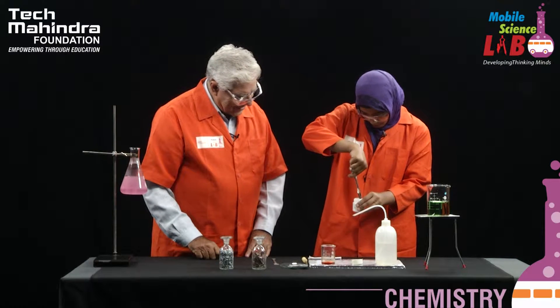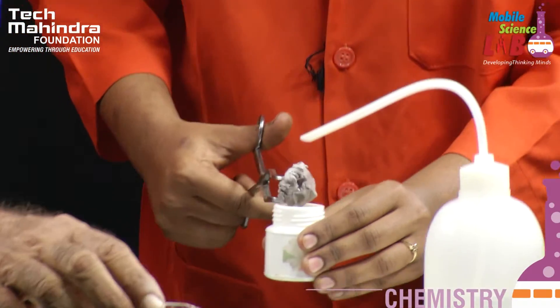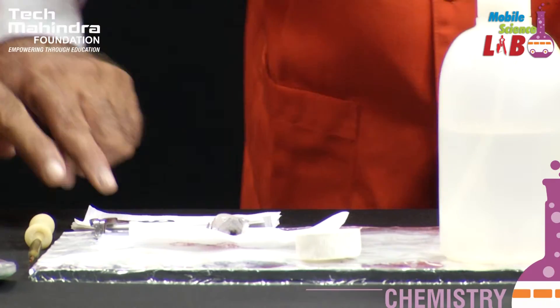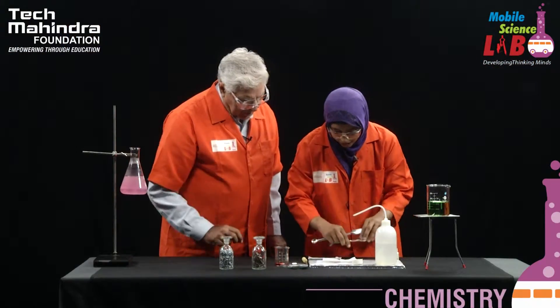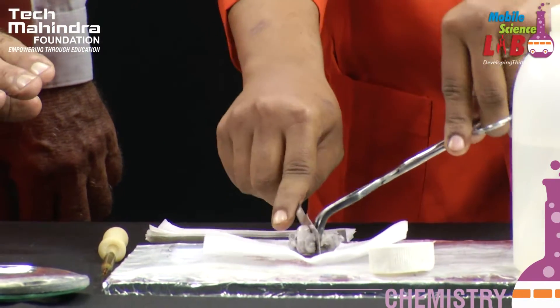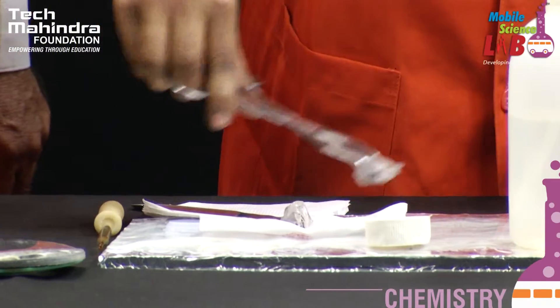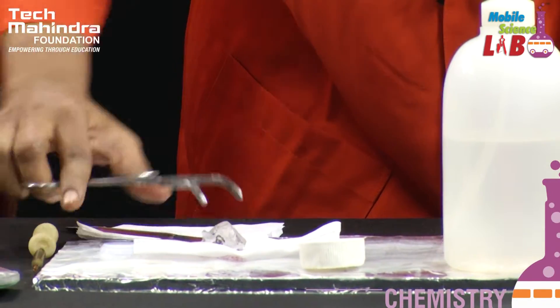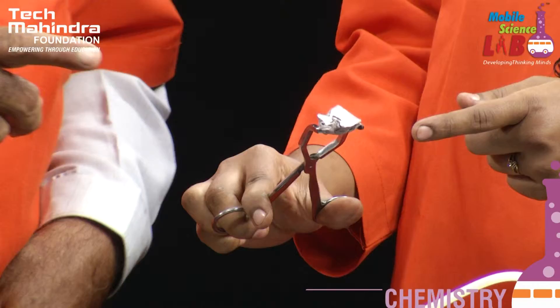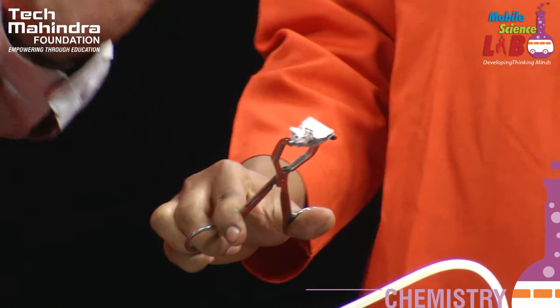As I told you, the characteristic property of metals is shining, and it's not shiny — it's very dull, sir. Please take out a small piece, put it on the tissue paper, and cut a small piece. Hold it with your tongs first, then cut a small piece. It's very easy to cut. Put away one of the pieces inside, and you can see the shining metal surface — you can show it towards the camera. That is the shining metal surface obtained just now by cutting, so there has been no time for the air to react completely. But as you keep observing, slowly the surface starts getting dull.